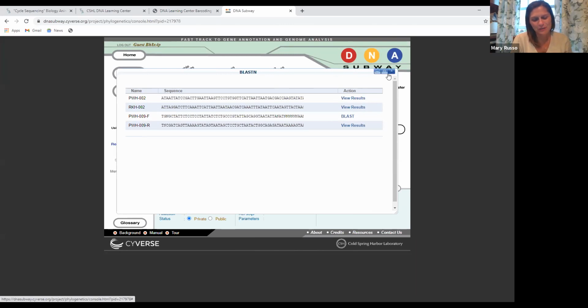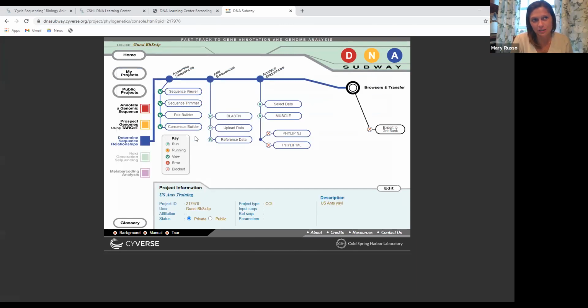So you should never, obviously trimming is the best, especially when your sequence is long enough where you don't have to guess. But let's say it's kind of small, and do you ever recommend manually changing a base if you feel pretty confident from the waveform, or no?